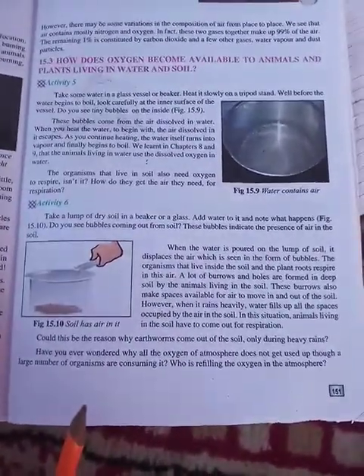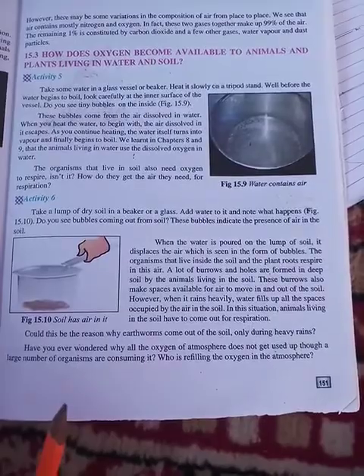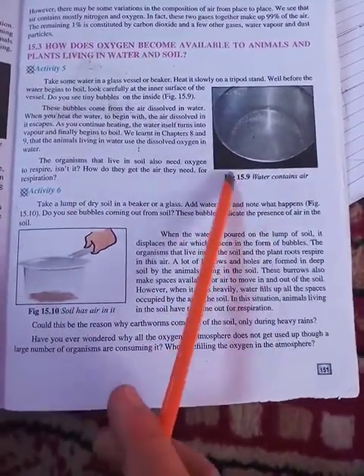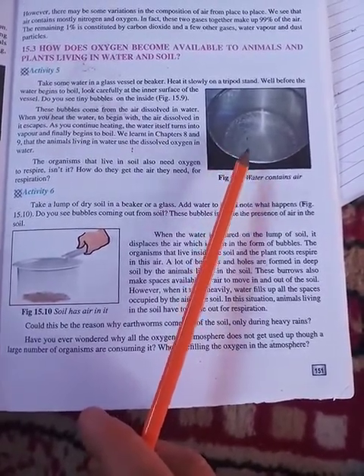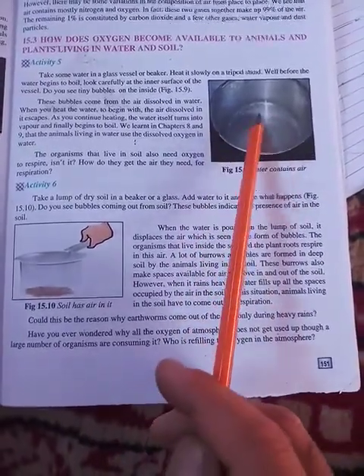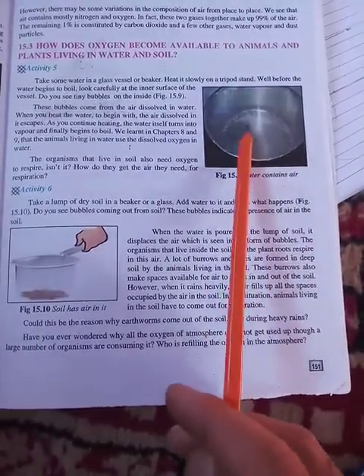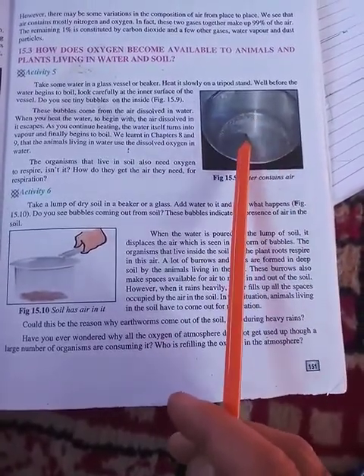Dear students, in the previous video we studied that the animals which live inside the water use the dissolved oxygen in water. So this activity shows that oxygen is dissolved in water. In this activity we have taken water in a beaker. When we heat the water, some bubbles come out of the water. These bubbles show the presence of gas in water. We can see oxygen gas in water.